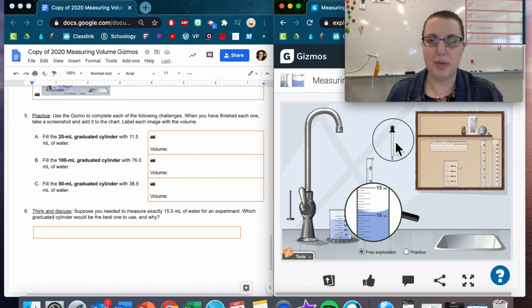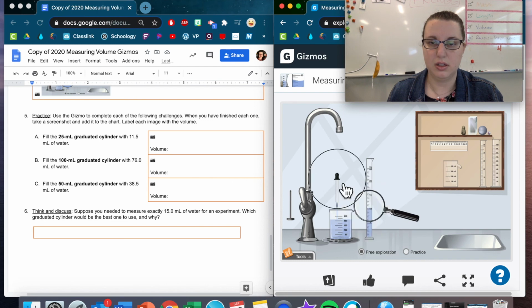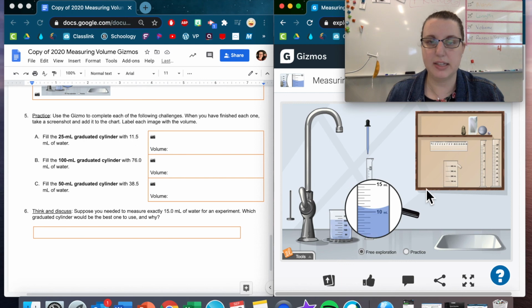So I need to get my pipette again. Fill it up with more water. Oh, I have to empty it. Then fill it up with more water. Okay, I'm gonna bring it over here. Get my magnifying glass again, ready to go. So I need 11.5. So I'm gonna do exactly what I did before. I'm just gonna slowly but surely, I'm at 11. And then you get to that small tick mark at 11.5. So that looks like 11.5 to me.